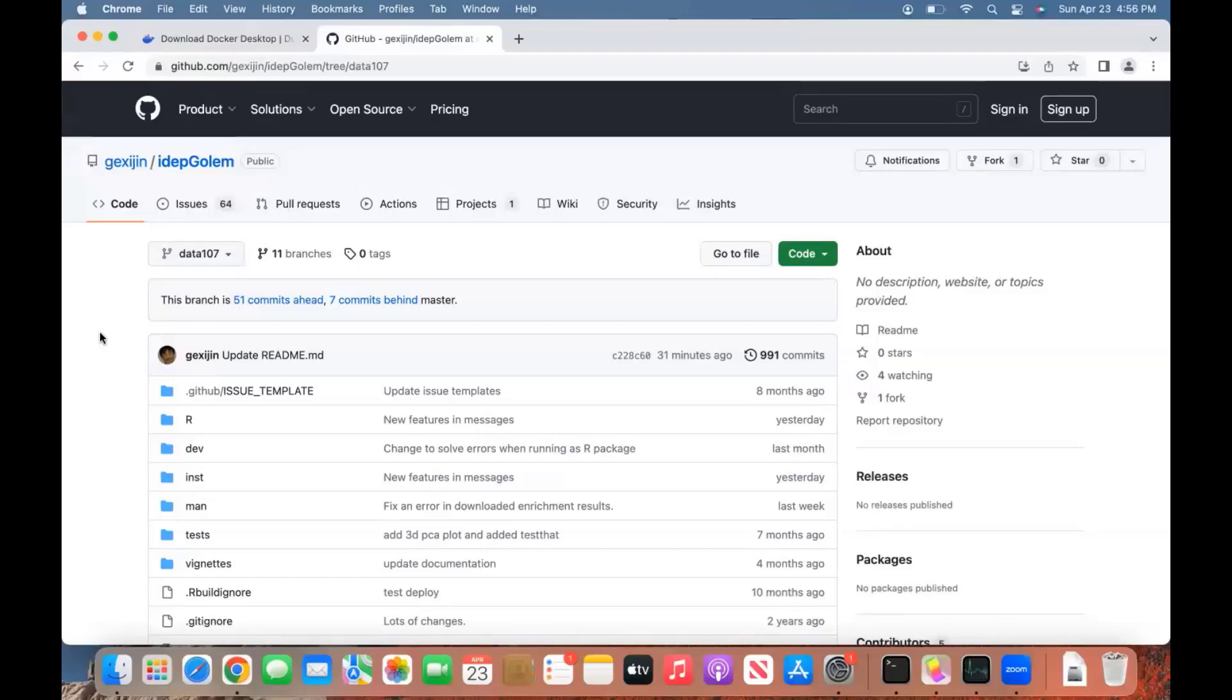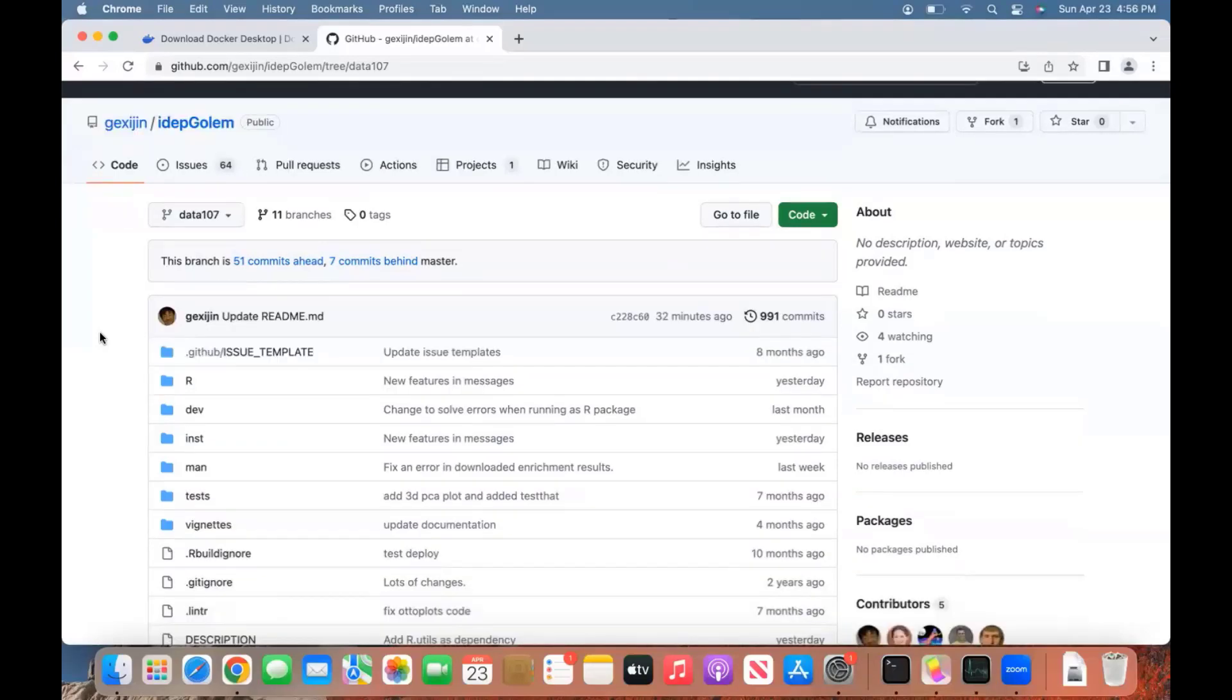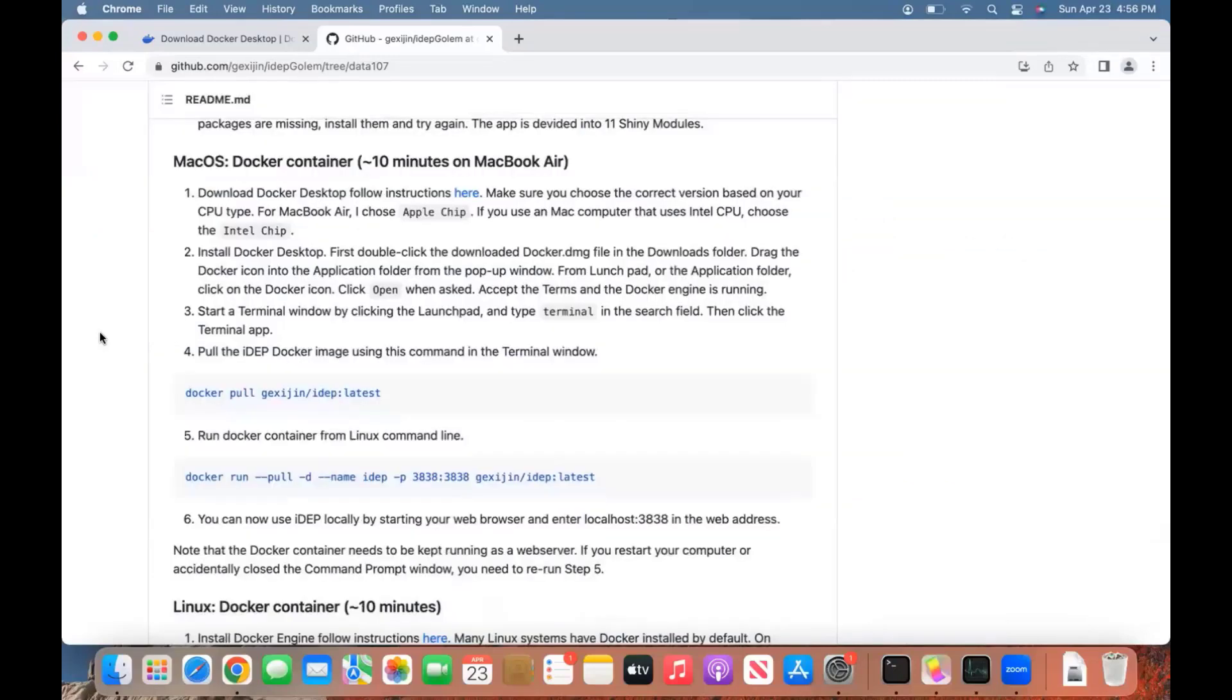In this video, I'm going to show you how to run iDEP locally on a Macintosh computer. I'm using a MacBook Air. We're going to follow the instructions on the iDEP GitHub page. The first approach we're going to take is using a Docker container, which is easier. Secondly, we can show you how to install this as an R package.